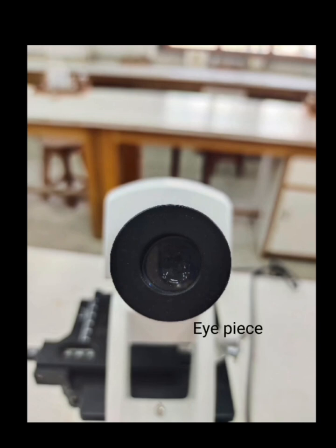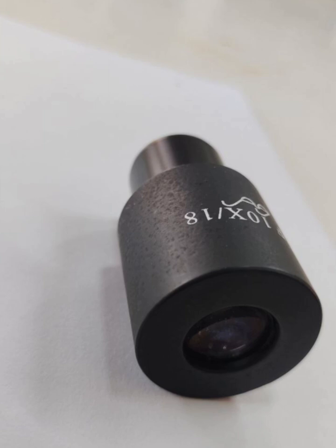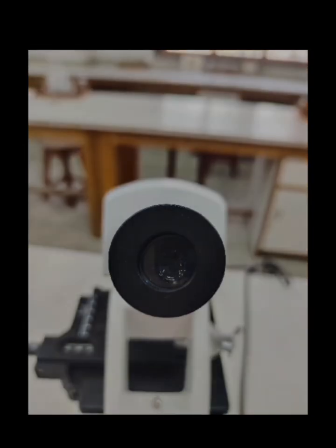Eyepiece is what you look through at the top of the microscope. Typically, standard eyepieces have a magnification power of 10x. Optical eyepieces of varying power are available, typically from 5x to 30x.